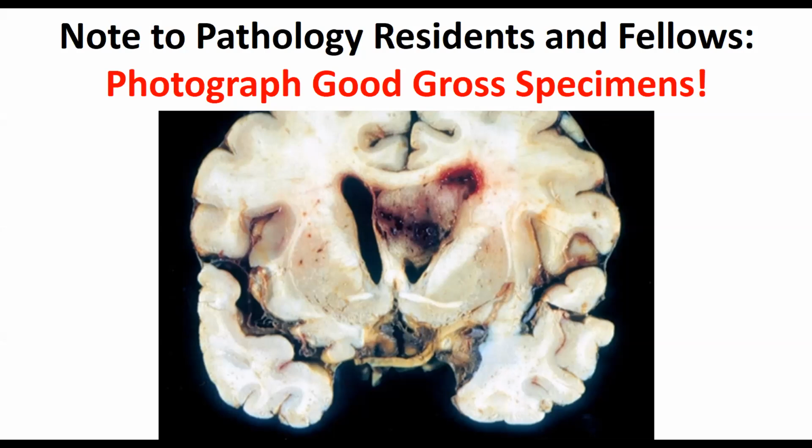I cannot delay the frozen. You don't have to delay the frozen. I mean, as long as the tumor is even half a centimeter, you can take a thin slice of the tumor, get cytology, get the yada, yada, yada, from the underside and photograph it as if it had never been mutilated. All right, and call medical photographers. You can keep both programs going.